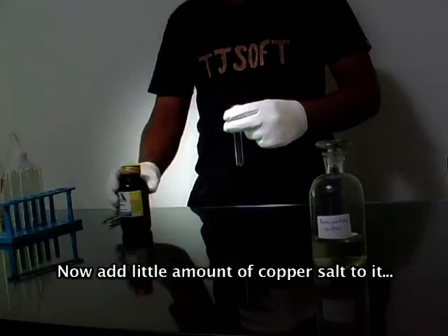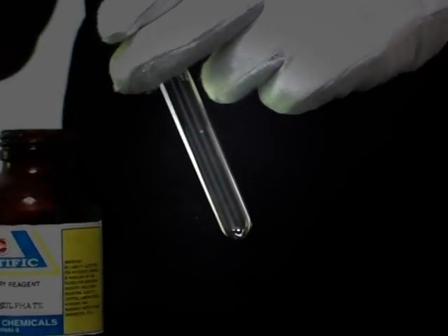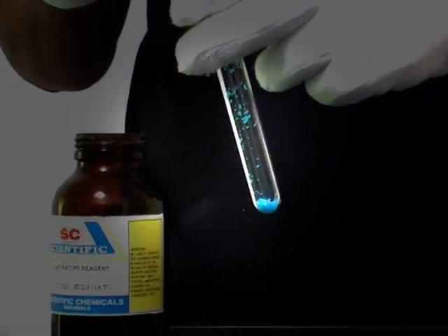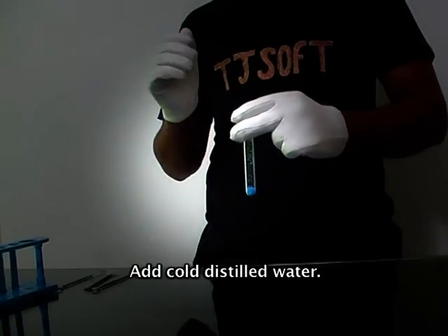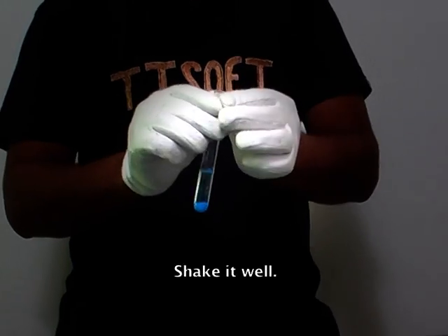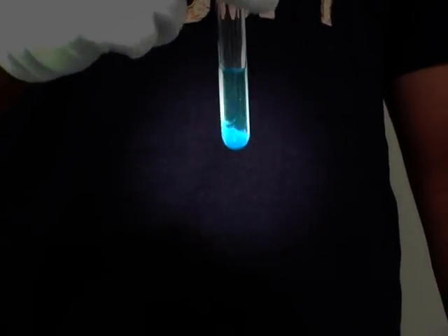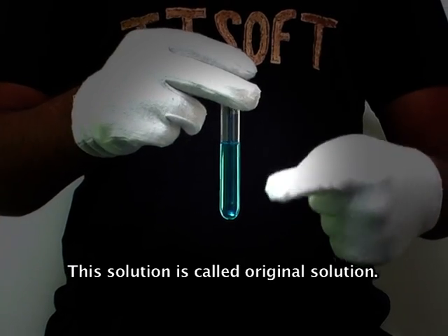Take a test tube. Add a small amount of copper salt to it. Add cold distilled water. Mix it well. The solution is called the original solution.